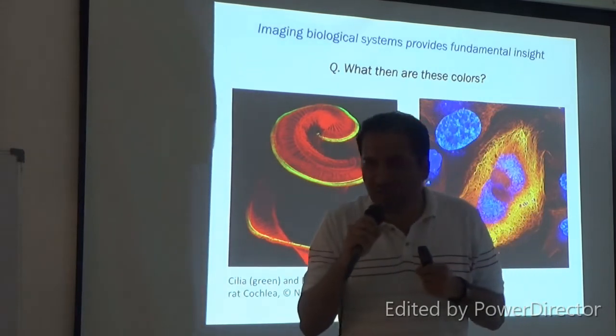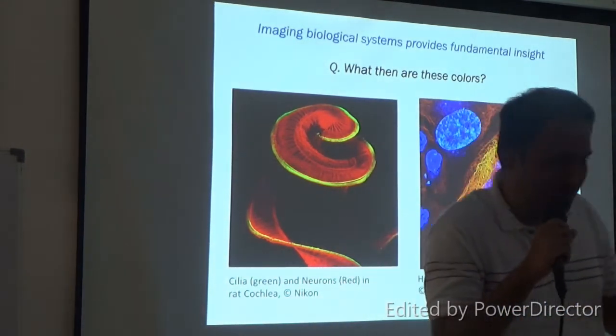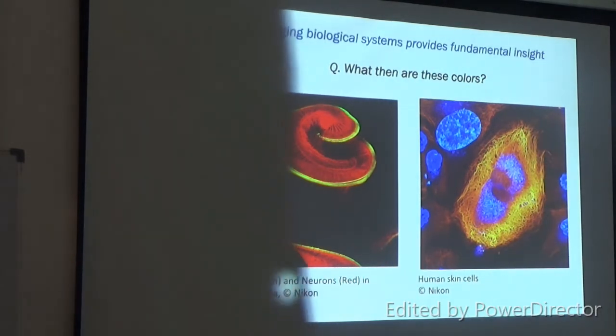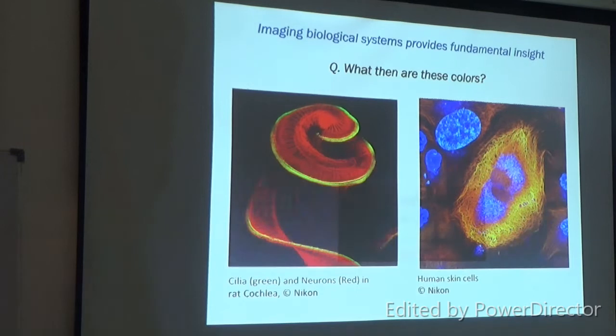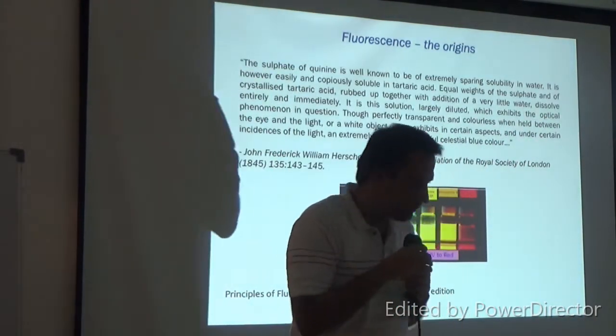So, do we know what fluorescence is? Some of us know, and some of us perhaps don't. So, let's go back to the basics and just learn a little bit about fluorescence.